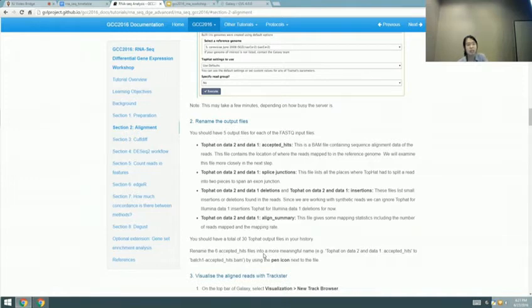That might indicate differential expression of this gene. The thing about this is this isn't normalized, this is just raw count data. So you probably have to do normalization methods, then your statistical analysis on top of that. But it's still quite obvious if a gene is massively differentially expressed, like that one. This one is higher expression than this sample.